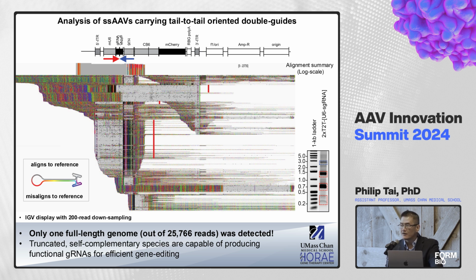So just to orient everyone to how to read these things, because I know a lot of people don't like using IGV, but I still think that these types of displays are useful. Reads that are aligning perfectly to the reference are in gray. Those bases that aren't matching very well are labeled in color. And then different speckles: if it's black, then it represents gaps, and if they're purple, then they represent inserts, right? So you can get a great deal of information from these types of investigations.